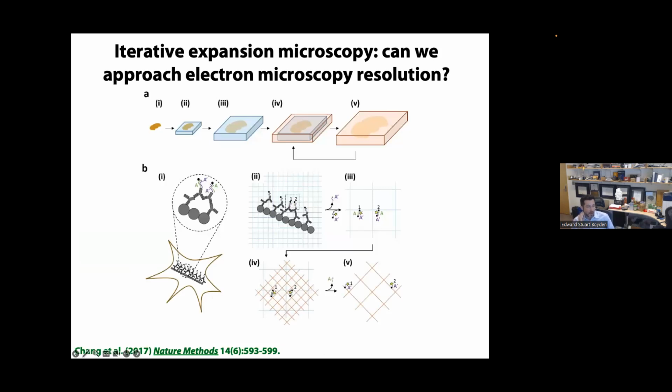Can you expand more? Well, you can change the polymer recipe and expand up to 10-fold. Several groups have done that, and there are protocols like X10 and T-Rex and so forth in the literature. But if you want to expand greater, the problem is the original polymer eventually starts to fall apart. And so in our group, we were wondering, can we expand something infinitely? Can you expand something basically as big as you want?